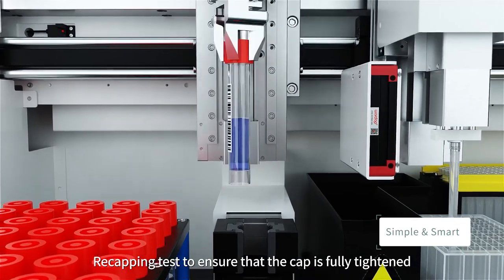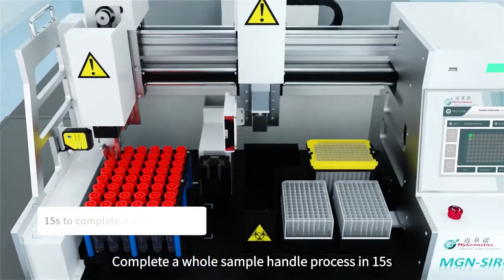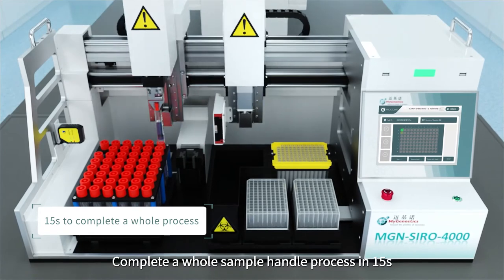Recapping test to ensure that the cap is fully tightened and sealed. Complete a whole sample handle process in 15 seconds.